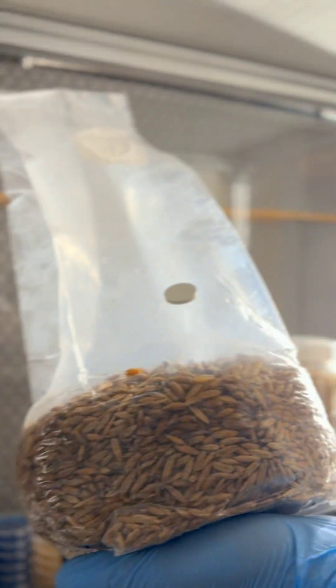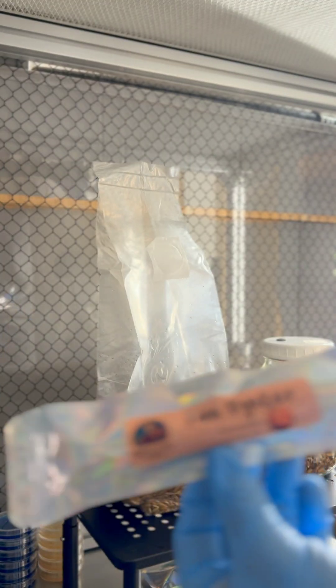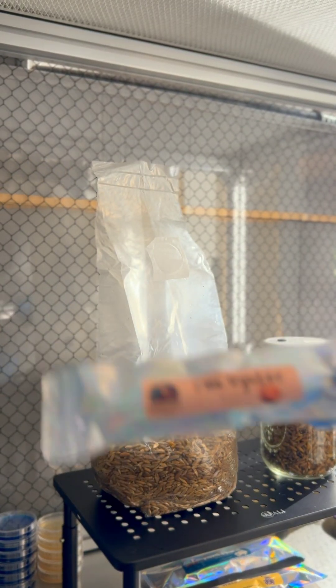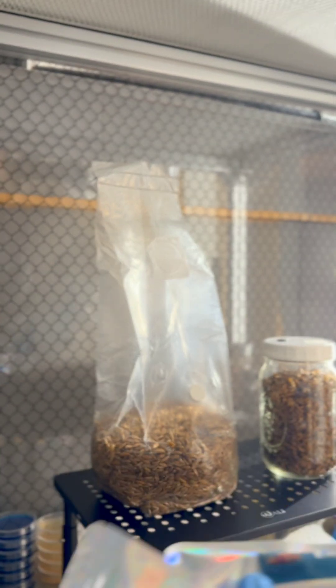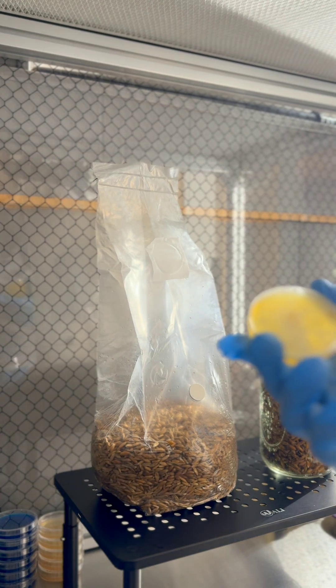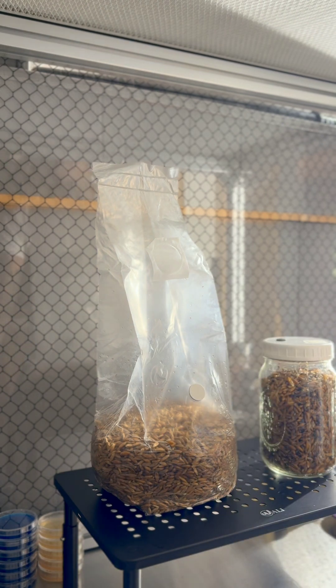Today I'm gonna show you how to inoculate your grain using a couple different methods. We're gonna use some liquid culture from our shop, but you can get this anywhere online from any mushroom vendor. We're gonna do some pink oyster liquid culture today. This process works with any culture — gourmets, medicinal, actives — but today we're using our gourmet cultures: pink oyster and lion's mane. I'm also gonna show you how to inoculate your grain using agar. It's a simple process, so let's go ahead and get into it.